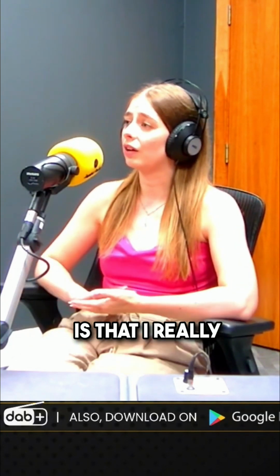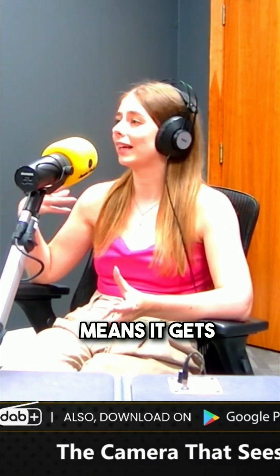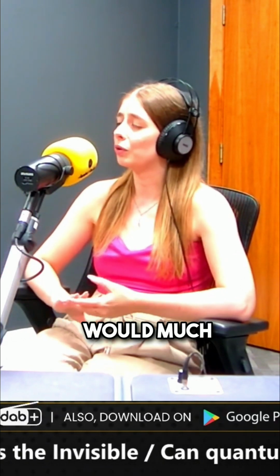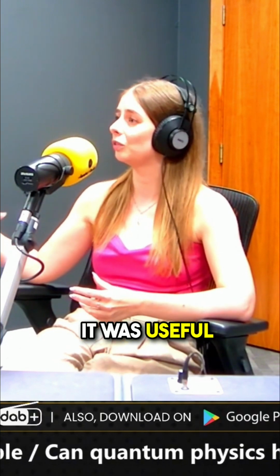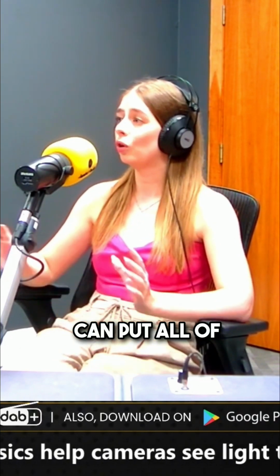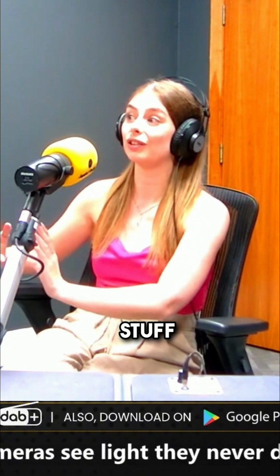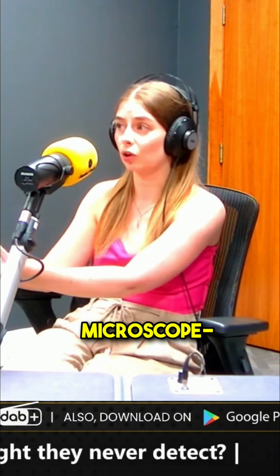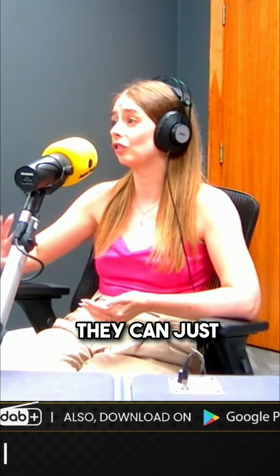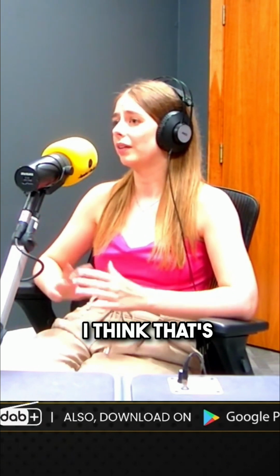And the other side is that I really want to make these systems look like microscopes. And I think, well, the hope is that means it gets into the hands of people who would then use it and they know what to expect. I would much rather people used it because it was useful rather than because it's quantum. And so if I can put all of the quantum magic stuff into a black box that I hide inside of a microscope, and the person I give it to doesn't have to understand anything about it, they can just use it like the microscope they used to, I think that's the goal.